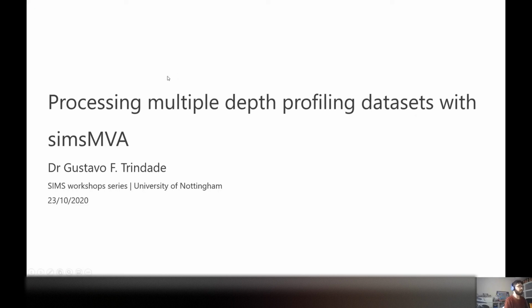And if you haven't seen the ones early this year where I introduced MVA in general and then simsMVA, I will paste the links to the recordings after this. Most of the things there I will not be covering today, so you may not be familiar with the terms, but hopefully it will be useful for everyone.